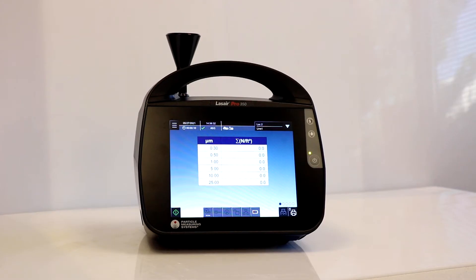In this video, we will explain the audit trail function, how to turn it on, and how to access the audit trail data for review.